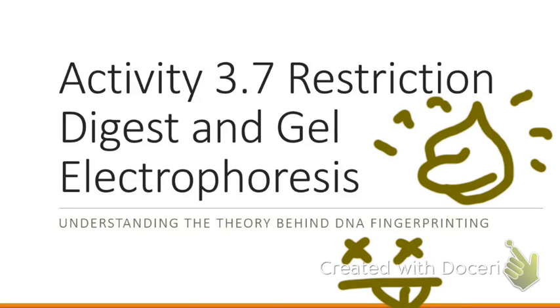All right, so what I'm actually going to do is I'm recording this just because I don't want to re-lecture it. Okay, so today is activity 3.7, restriction digest and gel electrophoresis. And today, the really important part is understanding how restriction enzymes work. They just cut DNA, and then why we use that with gel electrophoresis, which is the gel thing we were doing last time.